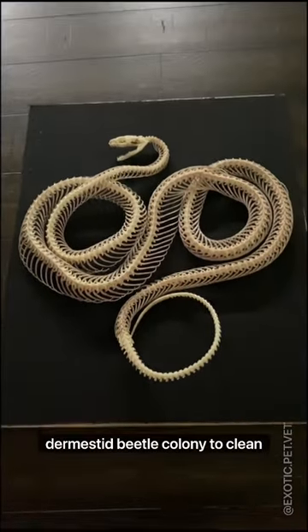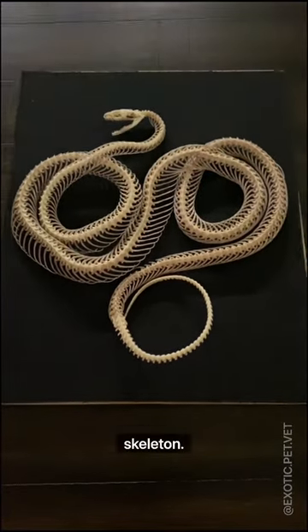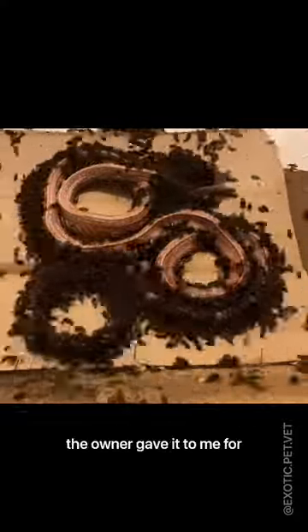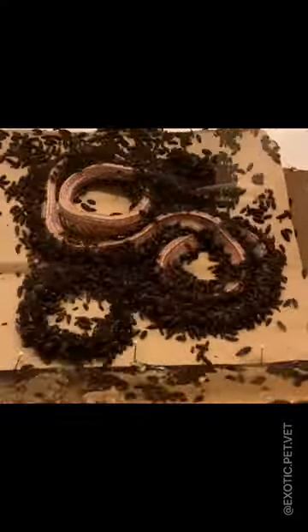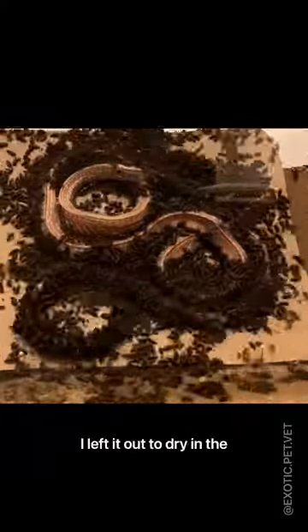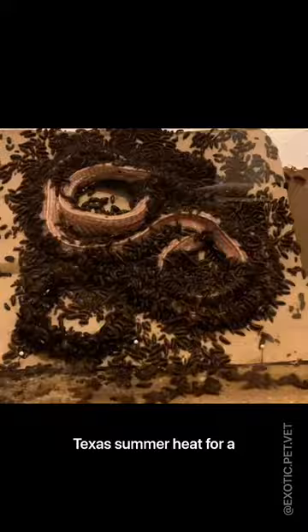Let me show you how I used my dermestid beetle colony to clean this corn snake skeleton. After this snake passed away from natural causes, the owner gave it to me for preparation. After removing the skin and all the internal organs, I left it out to dry in the Texas summer heat for a day.